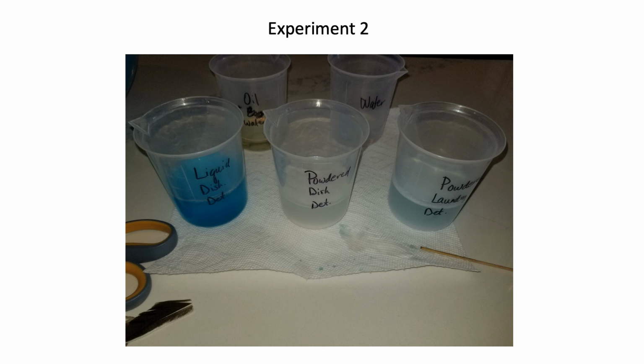Now, in step 9 is when we make sure we set aside the chamois and the feather as our control that aren't going to get exposed to any treatment. And then in step 10, we're adding a piece of chamois to the water, leaving it for 3 minutes, and then removing it and allowing it to dry on a paper towel. If you notice, steps 11 through 14 are repeating that for each of the different treatment groups.